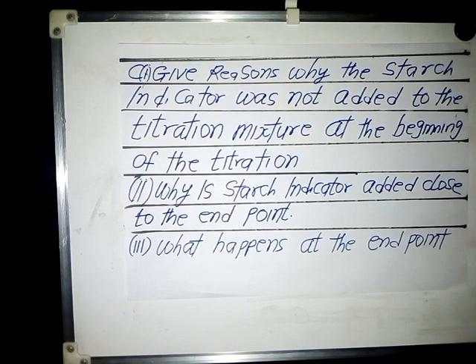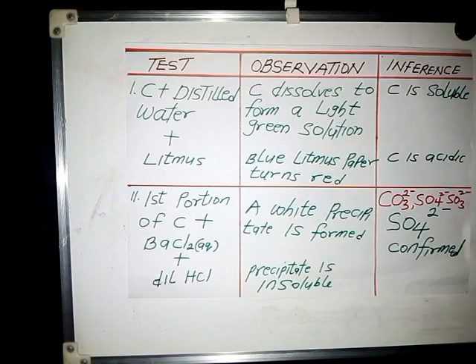So that's for the titration. So let's do the salt analysis briefly. Alright, for your salt analysis question, I'm going to draw this question.